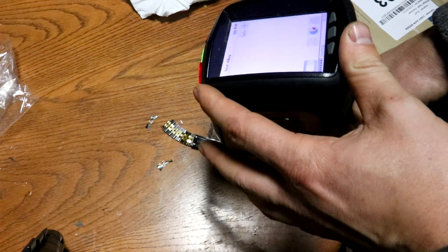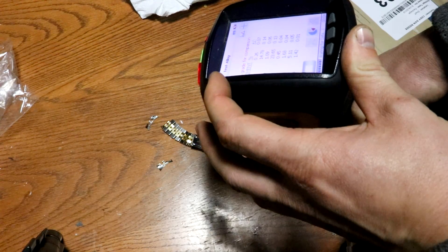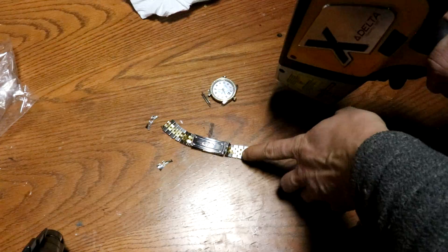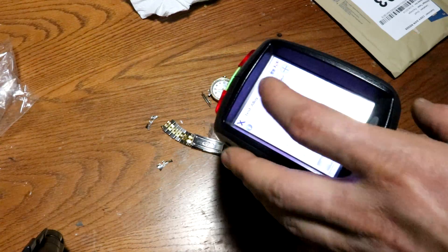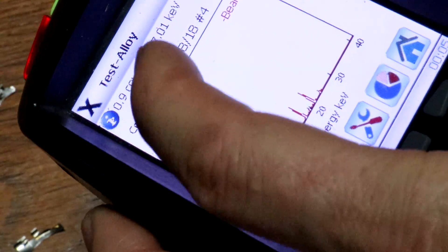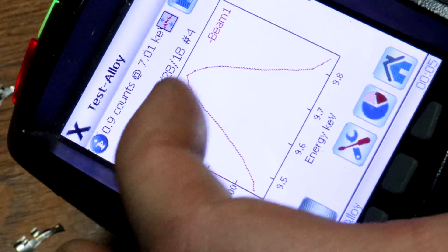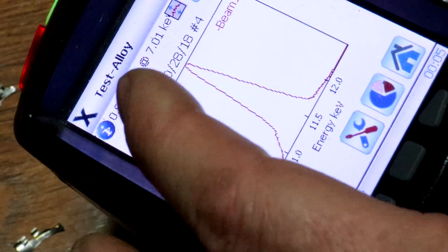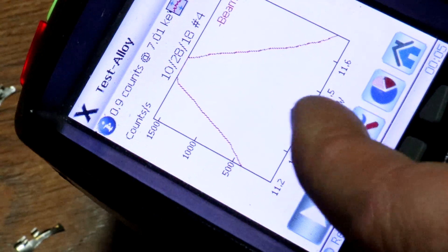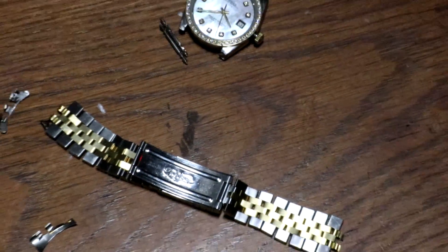Let's start right here, which we suspect to be gold, just to confirm and get an idea of how much gold is there. I can already see there's some silver, some iron, and nickel — probably metal around or under it. I don't know if it's solid gold or just gold-filled. There's a spike at 11.4, so there's definitely gold here — it's the most prevalent. I'd say maybe 18 carat.